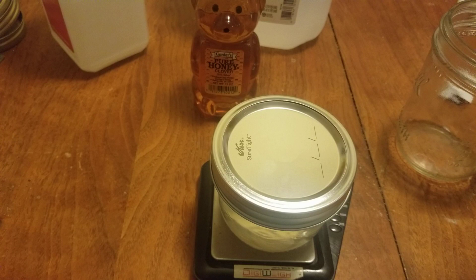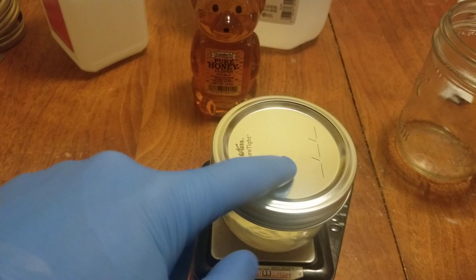Now, if you don't have a pressure cooker, of course you could always try the boil-in method. It's not recommended, but you can try it, and results may vary. If you're going to do the boiling method, I recommend that you leave your cap with no holes in it.